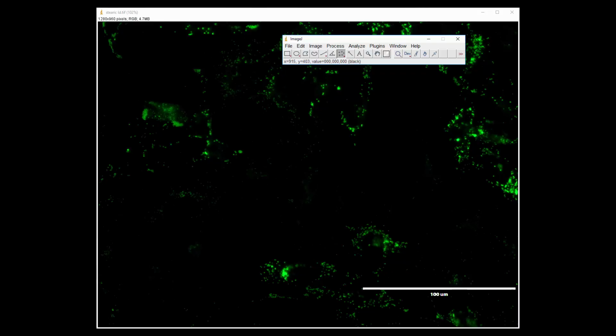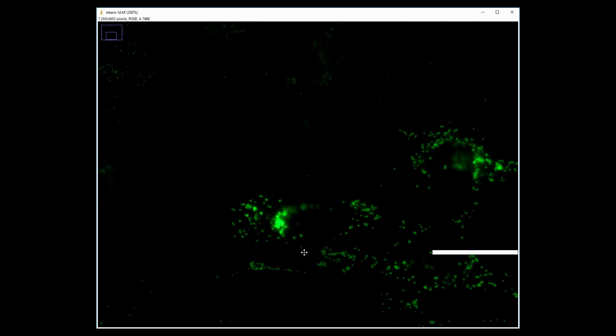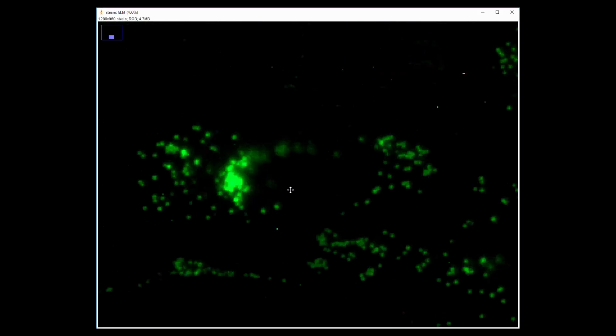You start with the first one, and you're going to do one cell at a time, because ultimately the number you want to get, the phenotype you're trying to measure, is number of lipid droplets per cell. Okay, and so we want to do multiple cells in order to get that. So let's just say that this was 1 down here, even though I know it's not. We want to zoom in on that one cell, and you can use this magnifying glass here to zoom in on this one cell. And let's just say this is our first cell, right?